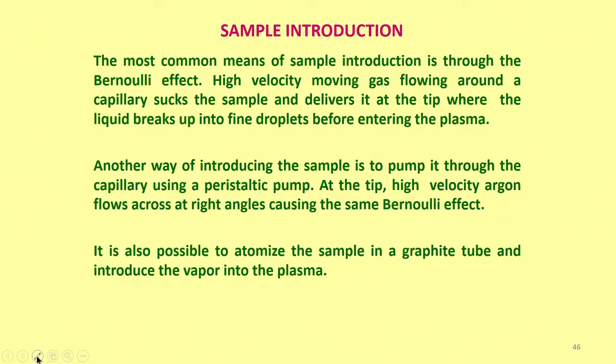It has to be sucked through the tube without touching any of the material parts and connected to the plasma torch. Let me see whether I can show you here.